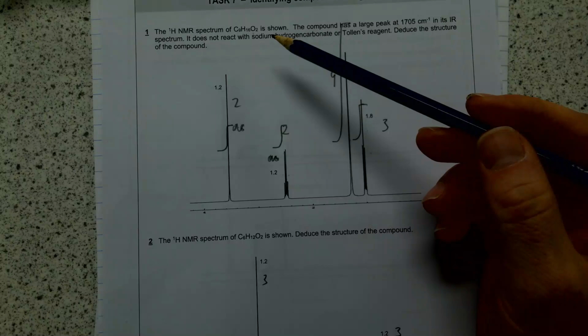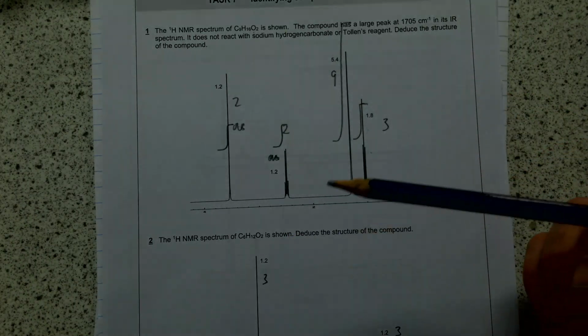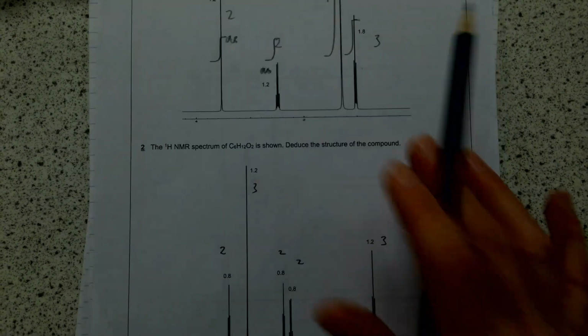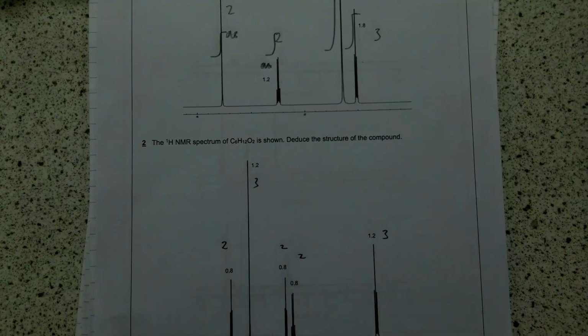Is it not in these cases? Occasionally it's a dialcohol, or it could be a ketone with an alcohol in it. It could be something else, but very often it's an ester if it's that. But you've got to have a little play. It's good fun to have a little think about it and be brave drawing molecules. Just have a go at it and see what you end up with.